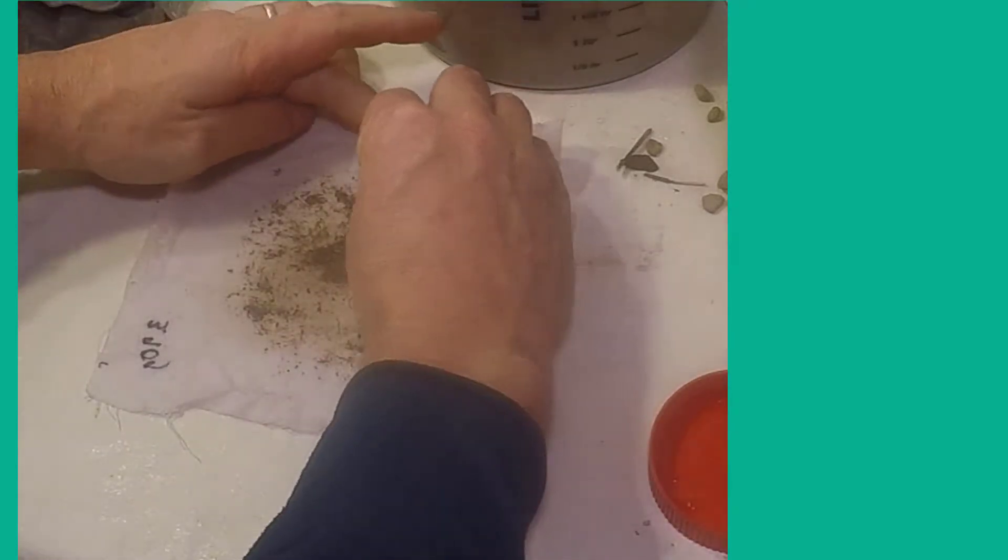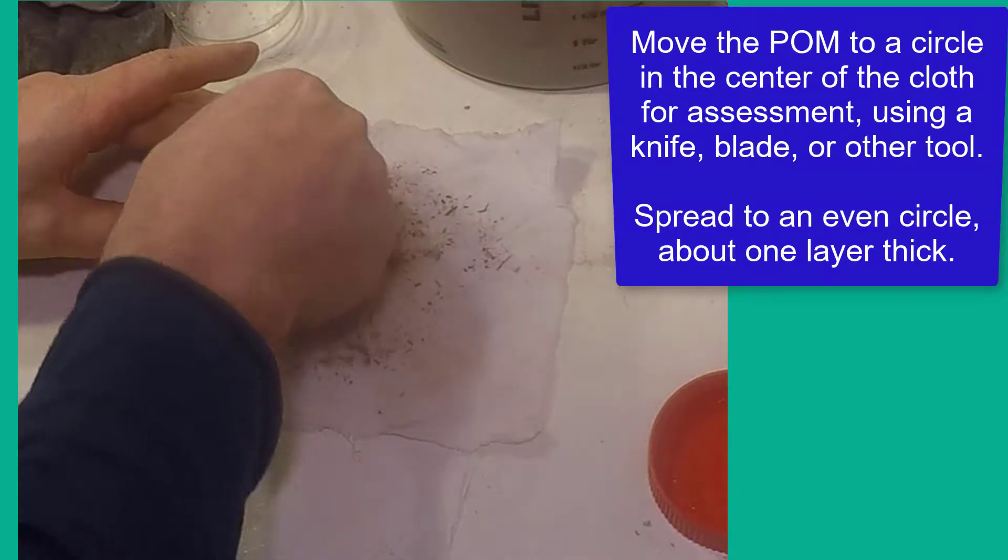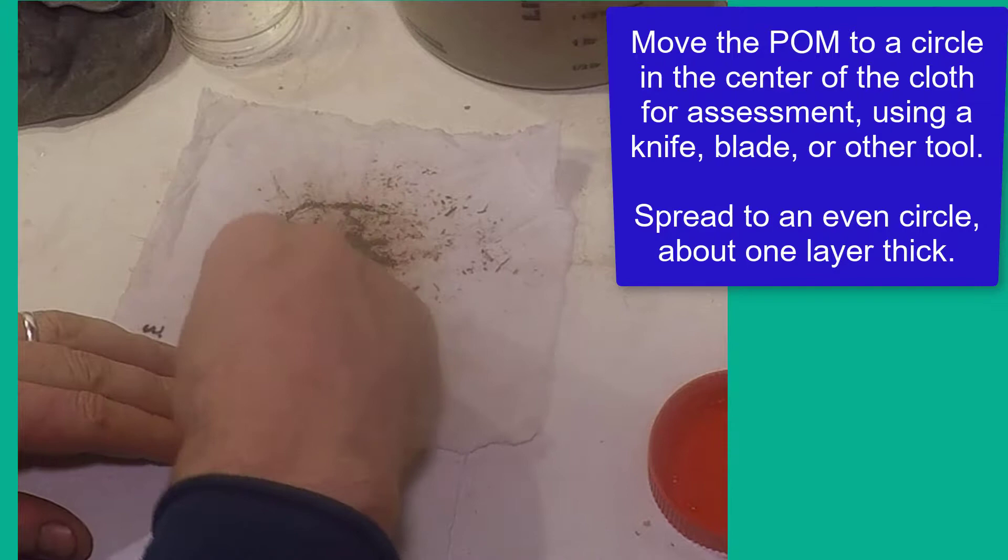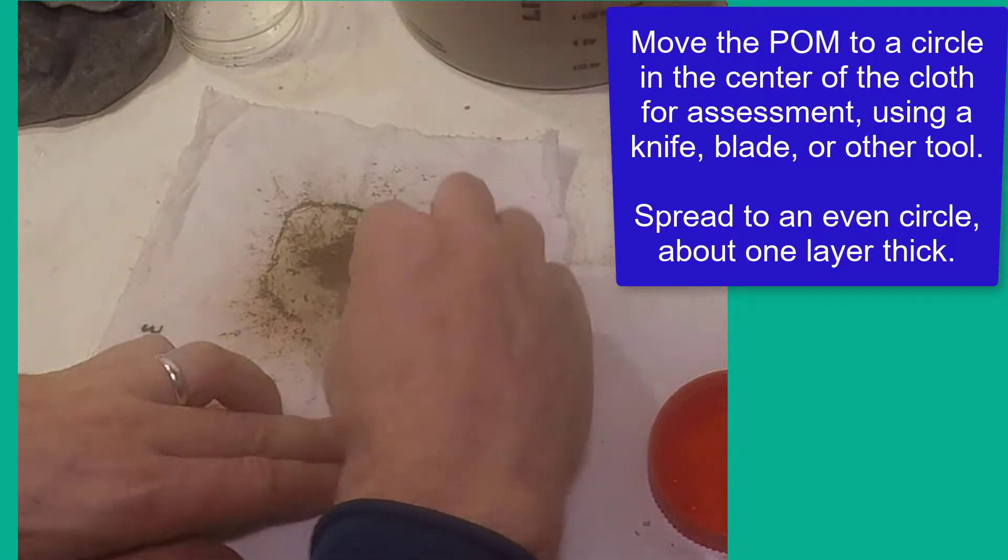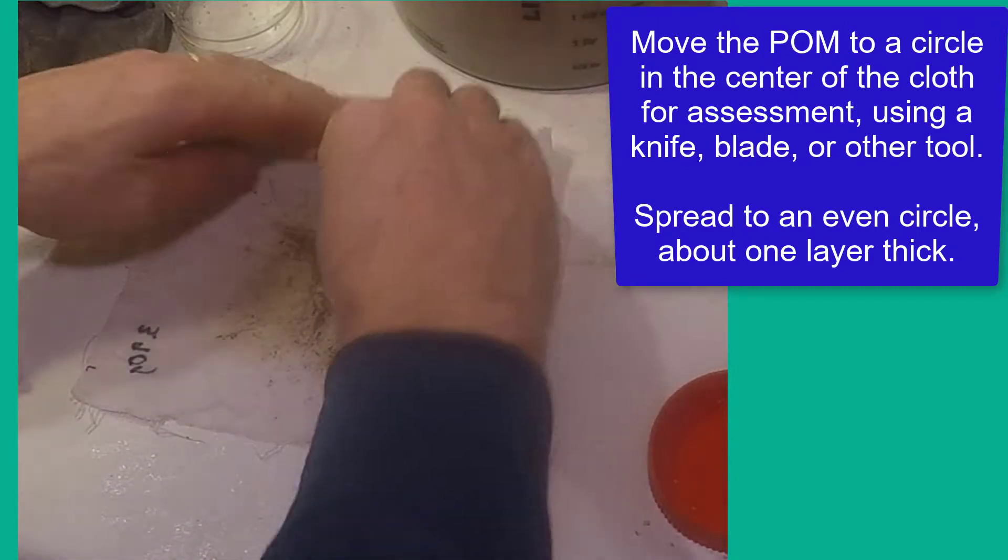Then, move all the material to the center of the cloth to form a circle. The diameter of this circle will give a qualitative rating of the amount of organic matter.